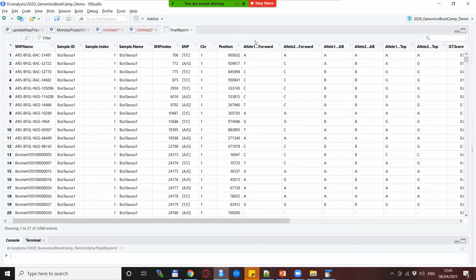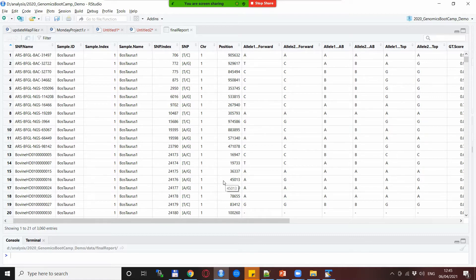For example we have allele 1 forward and allele 2 forward in our ped and map files for PLINK which is perfectly okay for us if we are doing any type of analysis like PCA or anything like that or even any more sophisticated analysis.